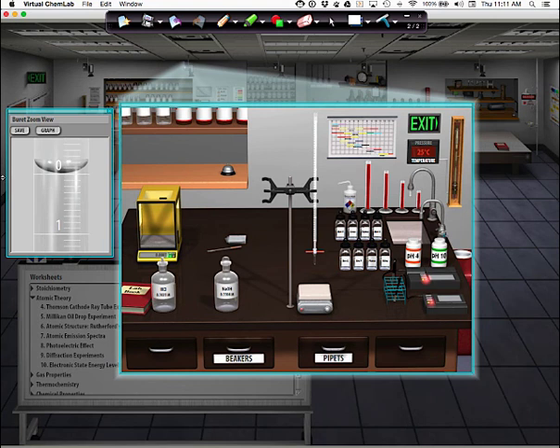But now guys, watch. Do you see what changed? What do we call this dip, reviewing for Sage? The meniscus. Where do we measure from the meniscus? The bottom, and it is sitting exactly on the 0 mark, which tells us, guys, that this thing is perfectly filled to 0. Get the idea? That's called zeroing a burette. Okay, so now we're ready to move on.